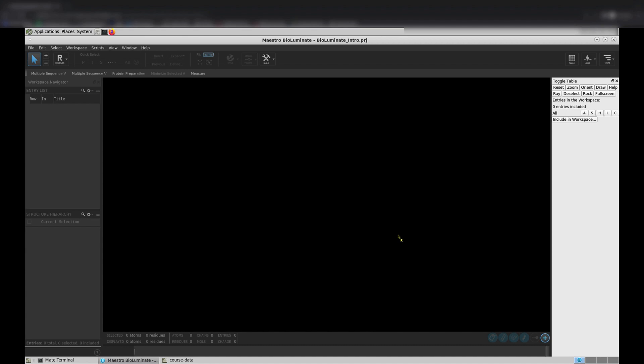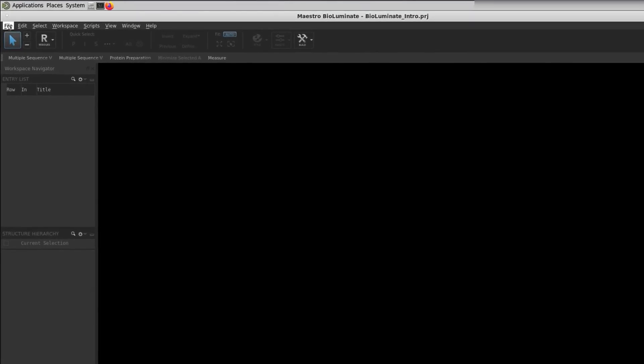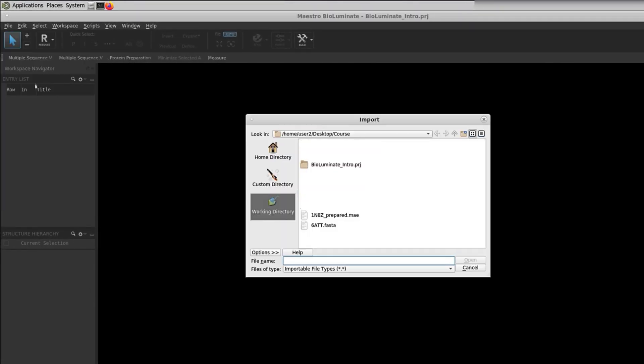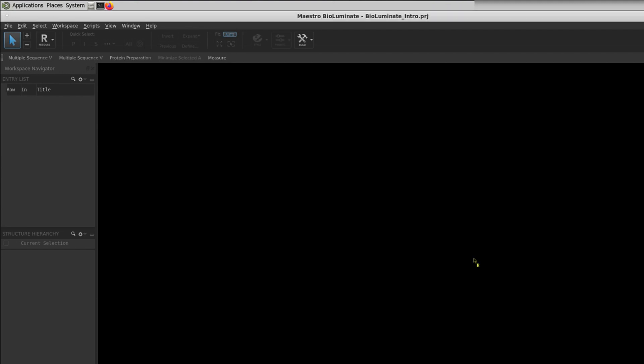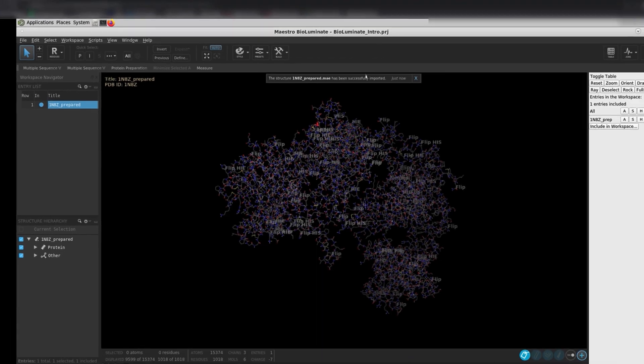We are now going to load in the crystal structure of the extracellular domain of Human HER2, complexed with the Herceptin FAB. Go to the left corner of the interface, and go to File and choose Import Structures. Select the 1N8Z underscore prepared dot MAE file. Once you open the file, a banner will appear at the top of the 3D workspace.